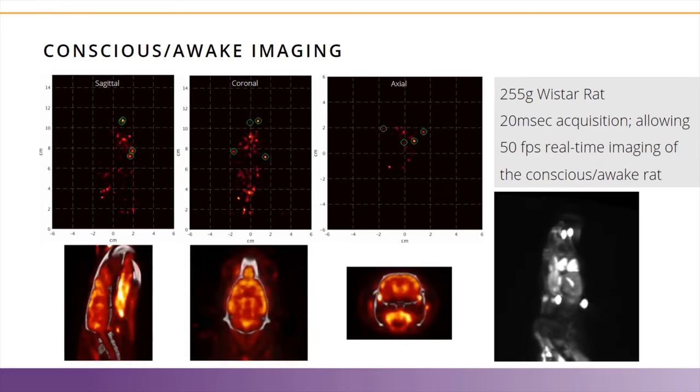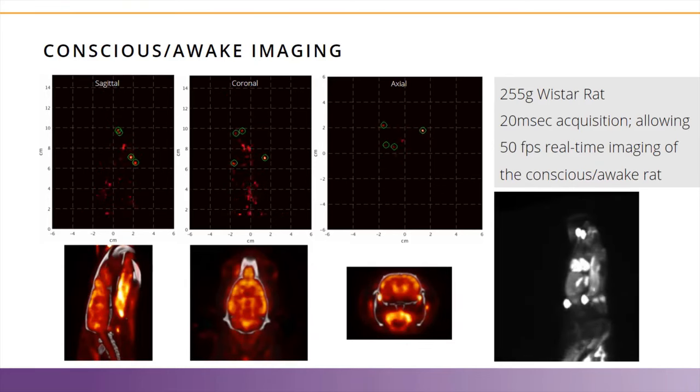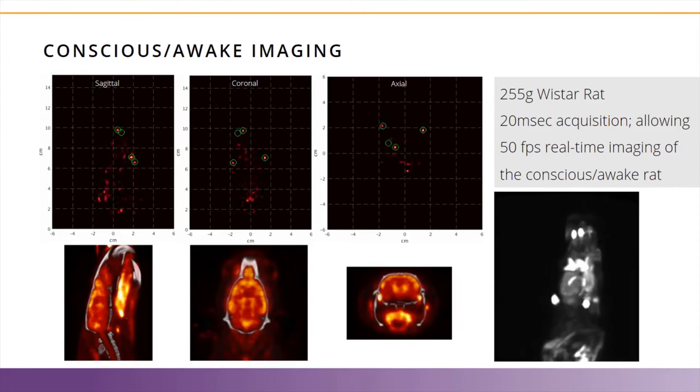Below, the resulting motion-corrected images can be seen. These could also be split to provide a dynamic image in 3D over time, if you were interested in the dynamic process. For example, changes in brain activity as a result of a stimuli. Again, this is a newly developed technique which has not been possible in the past. We would love to chat with anyone who has some ideas on studies in which this could be utilized to study any number of neurological disorders.